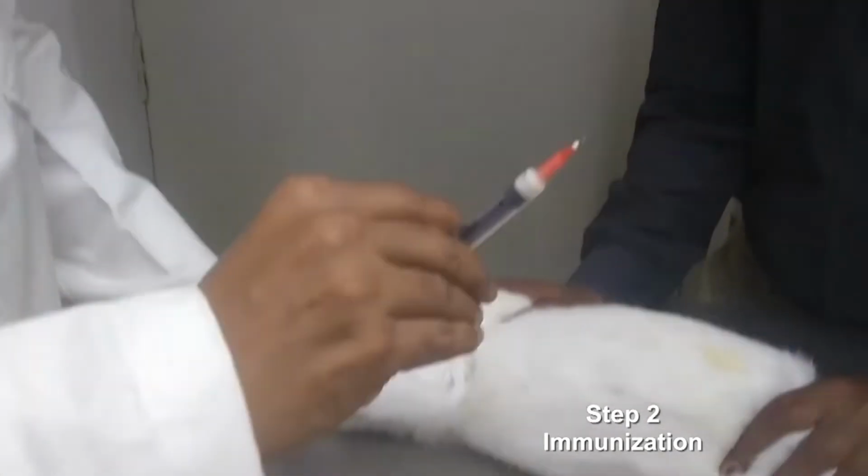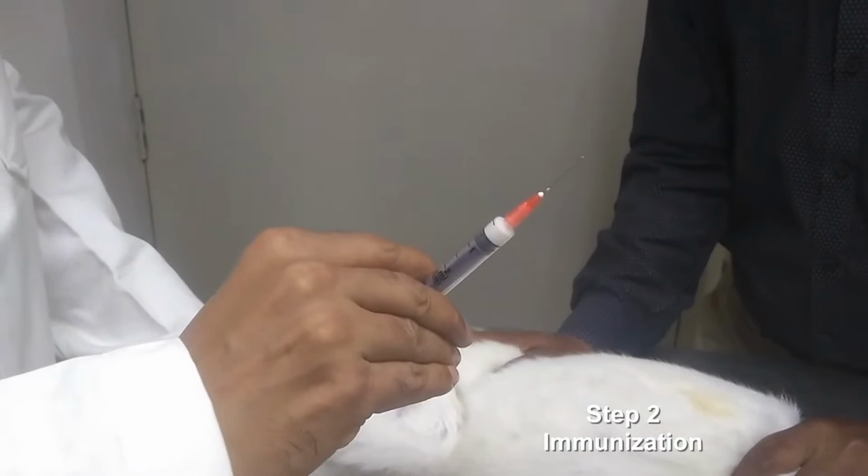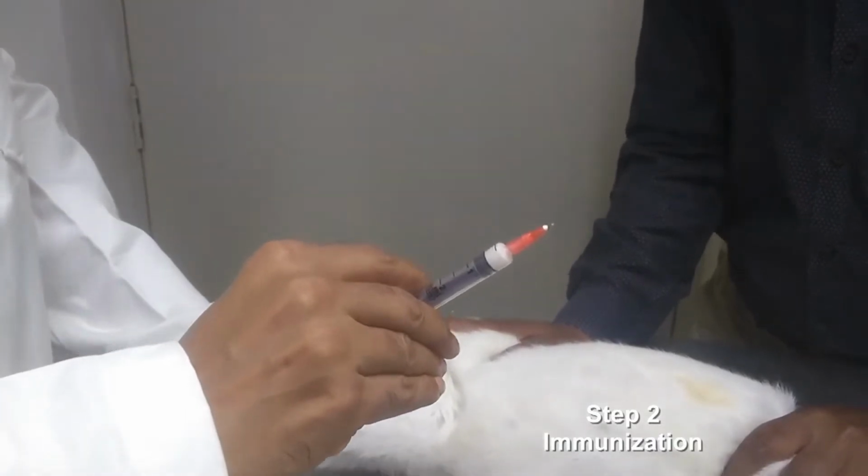We have to take out all the air from the syringe and the needle.